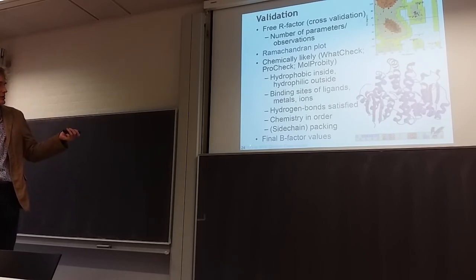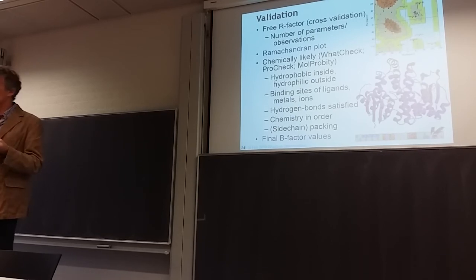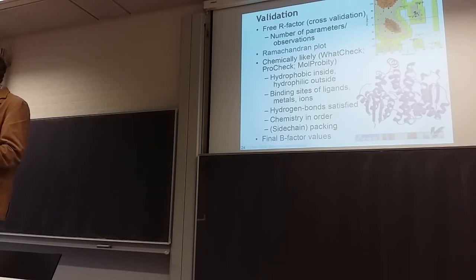And this is recorded at a global scale in what's called an R factor, just like the residual, and there's different variations of it. It's a very easy trick to get your R factor lower: you just add water molecules in your structure, not in the crystal, they're always already in your crystal. You add them in your structure, and that's a very easy way to get the R factor lower.